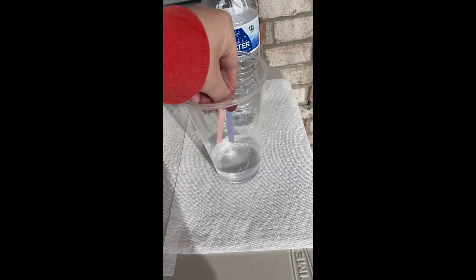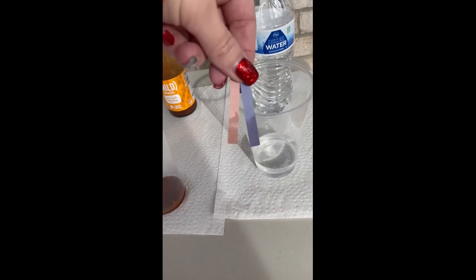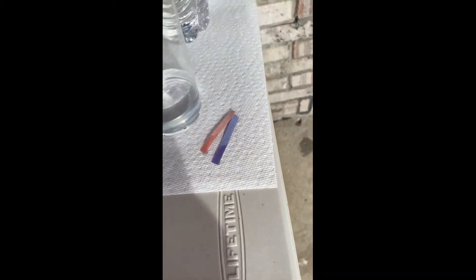We're starting with water. Go ahead and dip your red and blue litmus paper in the substance and see what color it turns. Water does not turn a color because it is neutral.